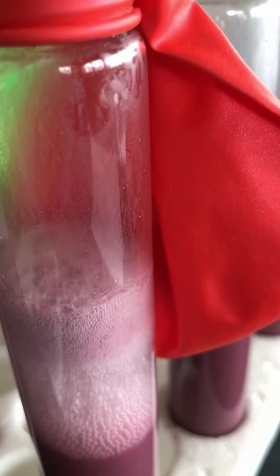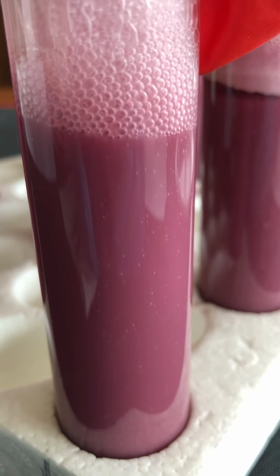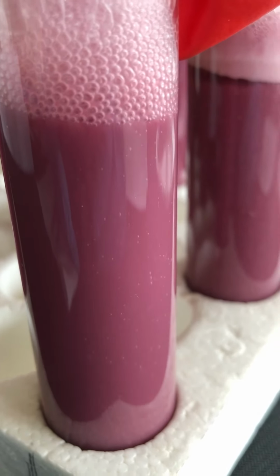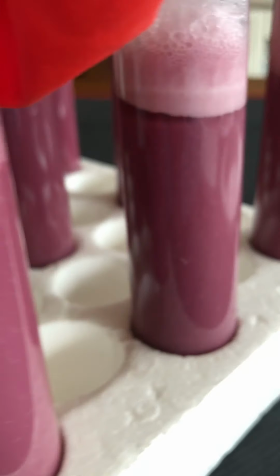So it has still only been about 15-20 minutes, haven't performed any kind of measurements yet. Really just want to have this reaction proceed. We're doing this at room temperature. We haven't accelerated this at all, so it might be a very gradual process, but nevertheless, you can still see the evolution of bubbles.